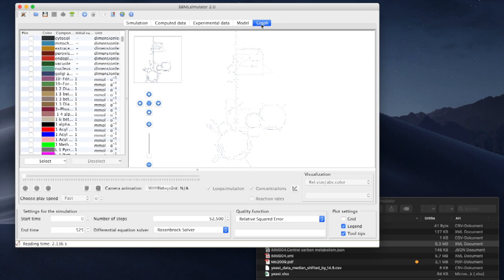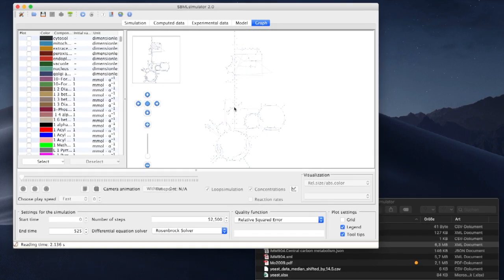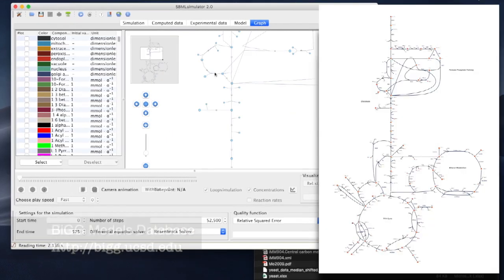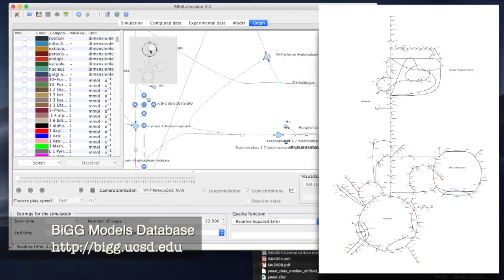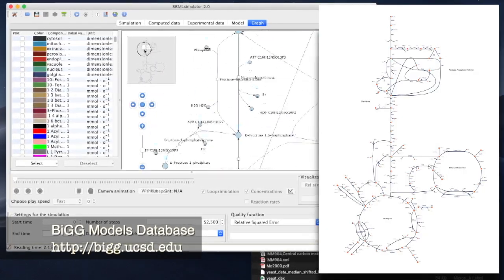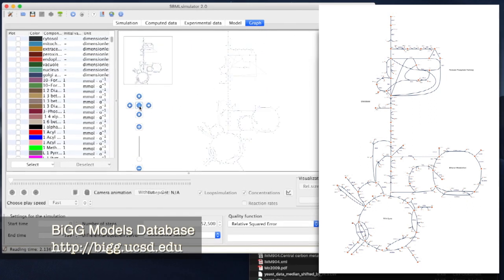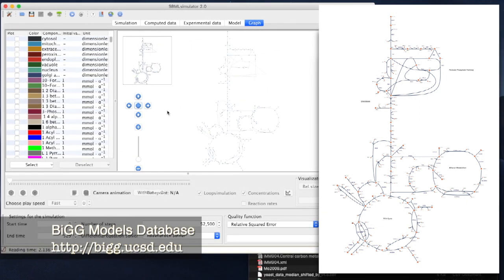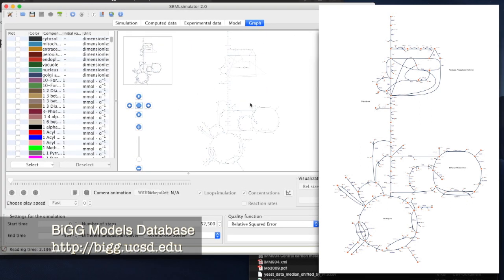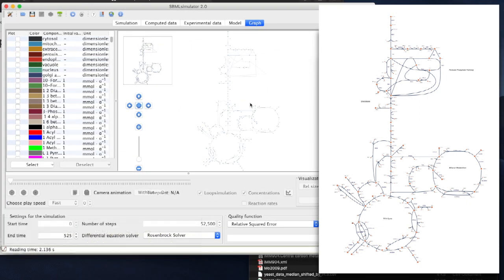The Graph tab now shows us the same neat display that we already saw on the Big Models website. Now let's find out how to create a dynamically animated network of yeast.